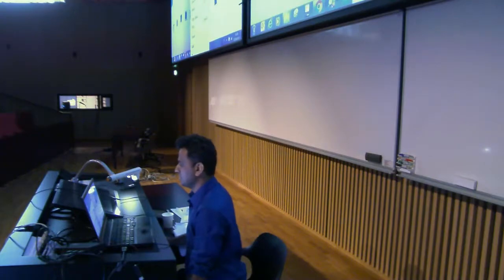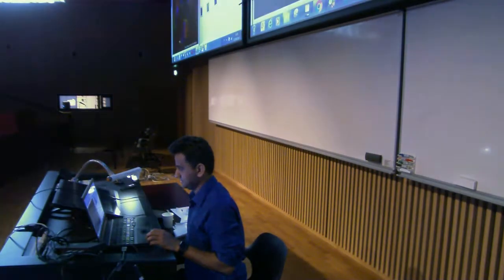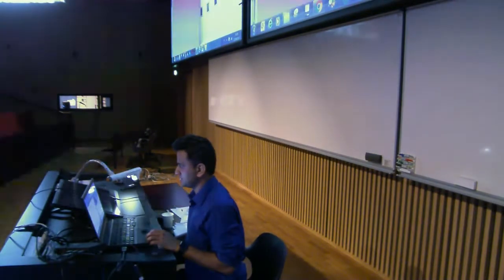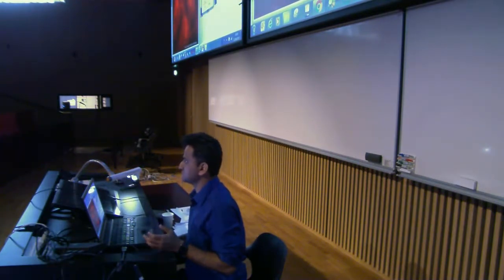So let's check. I go here, open sample, image, color, split channels. Let's not get confused, maybe this one. Yeah, and I'm only interested in this one, image, adjust, contrast. If I hit the auto button, okay. So now, of course, it is just the visualization up until this point. Whenever I hit the auto button, it becomes oversaturated, right? You can always reset it to the original data. But the moment you hit the apply button, you won't be able to go back to reset.